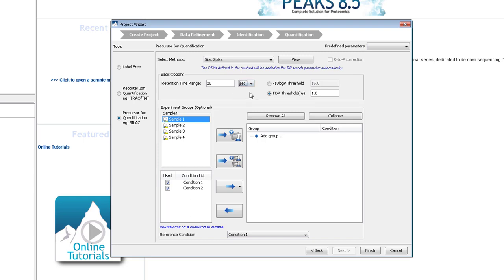Also, it's best to only allow peptides within a 1% false discovery rate to be used for quantification. Below the parameters, you can organize your experiment.